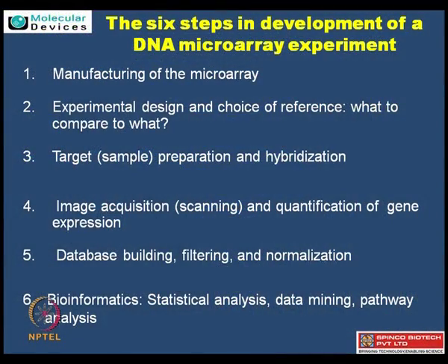Sure. So basically the DNA microarray steps are divided into 6 basic steps, starting from the manufacturing of the microarray. Based on the slide and your biology, the manufacturing of the slide is done. Say if you want to go for the RNA expression chip, you have an RNA expression chip made. If you are using a protein expression chip, you are using a protein expression chip. After the design is decided, the next step is the experimental design, which scientists usually think of based on the biological question they are asking. Based on that, they choose which reference and which controls to be studied and group them.